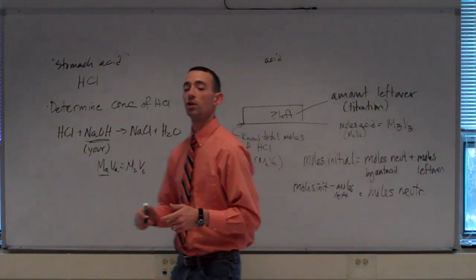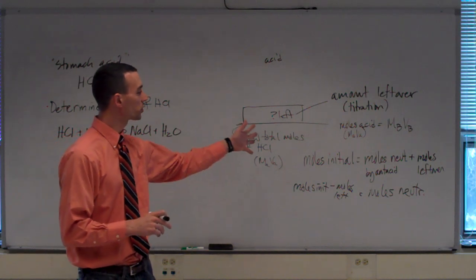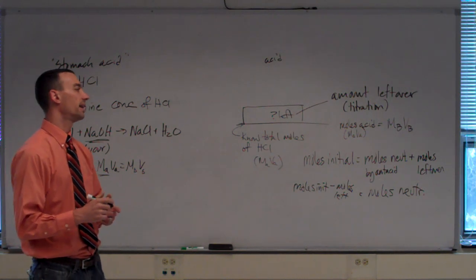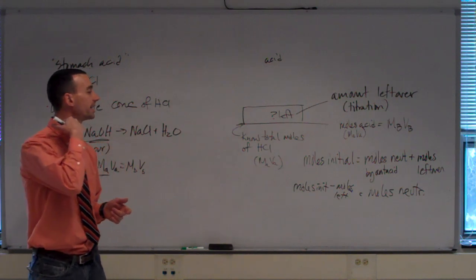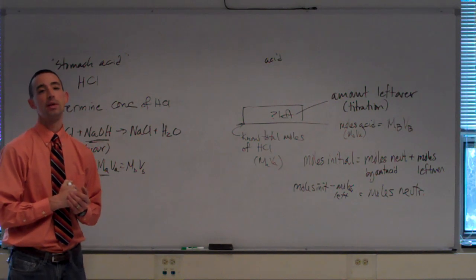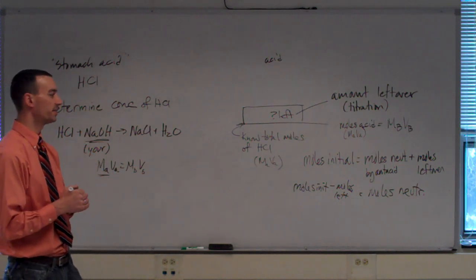Okay? So you're working with acids and bases. Everything you generate in terms of waste today can safely be put down the drain, because you'll be neutralizing all of your solutions, acid and base. Your indicator is bromophenol blue. It is a chemical that will appear yellow when it is in acid and blue when it is in base. So you'll be watching for the yellow to blue transition, as opposed to the phenolphthalein indicator that we used in the benzoic acid titration, which went from colorless to pink. We have a different indicator in this experiment, yellow to blue.